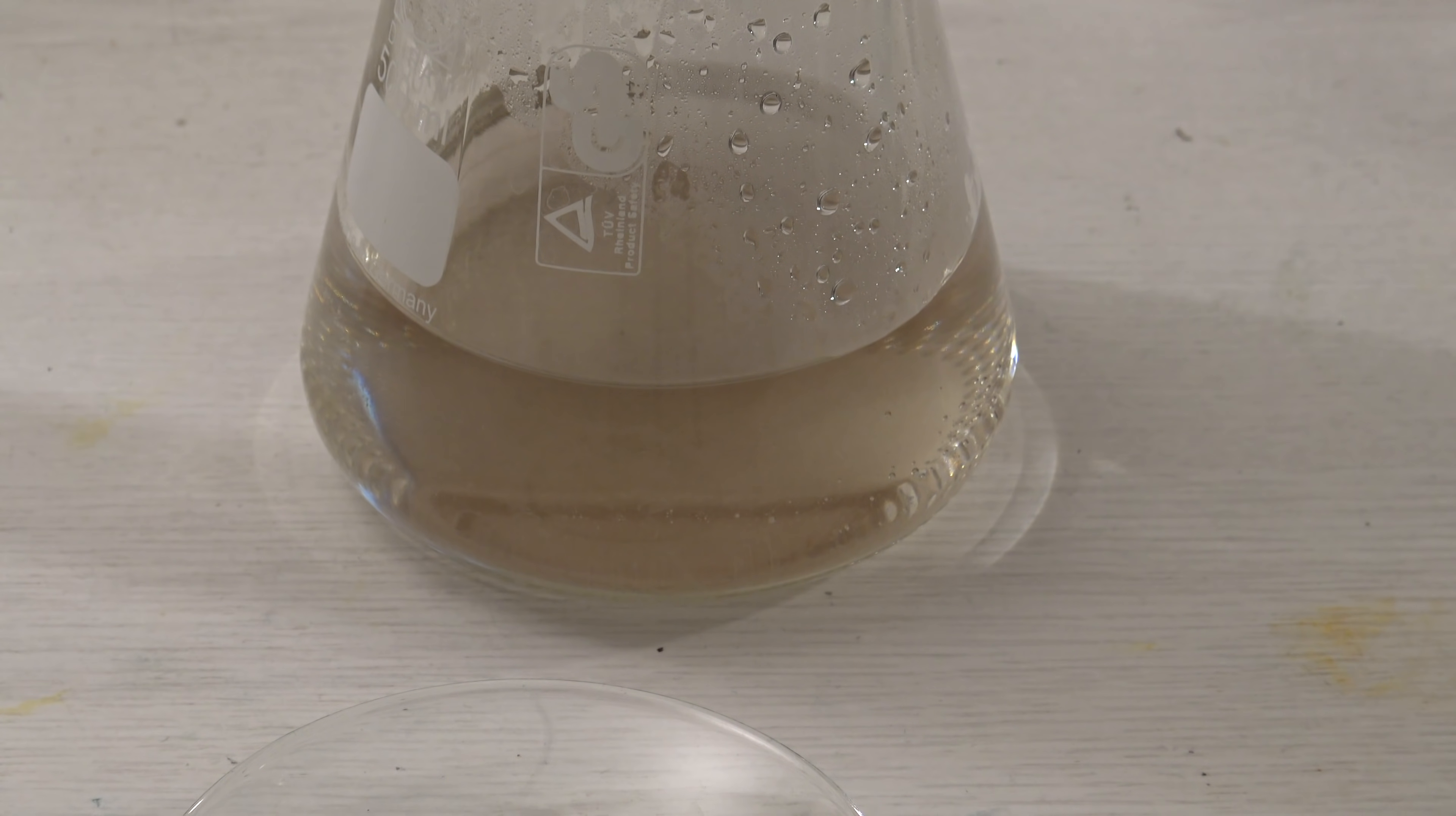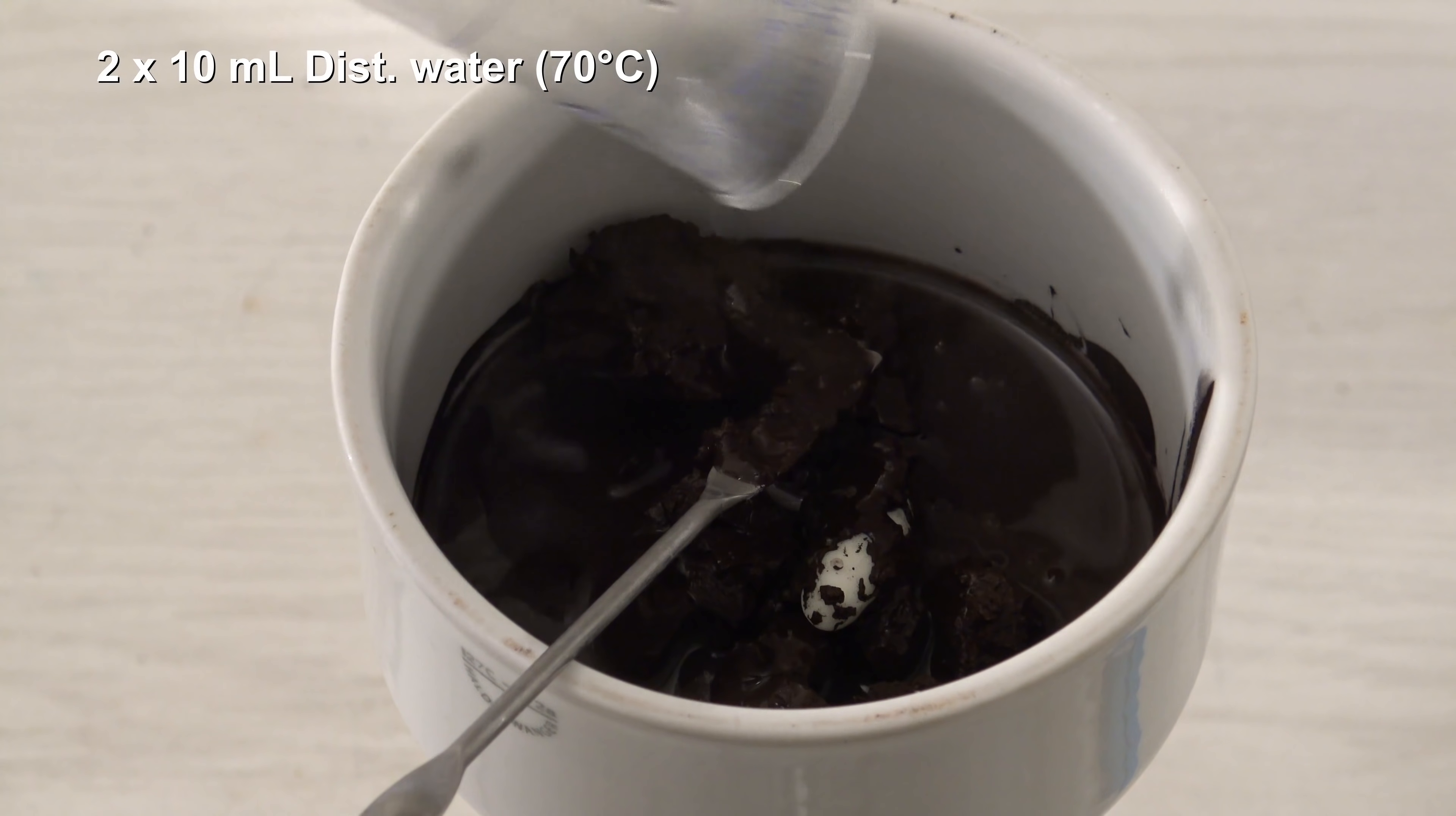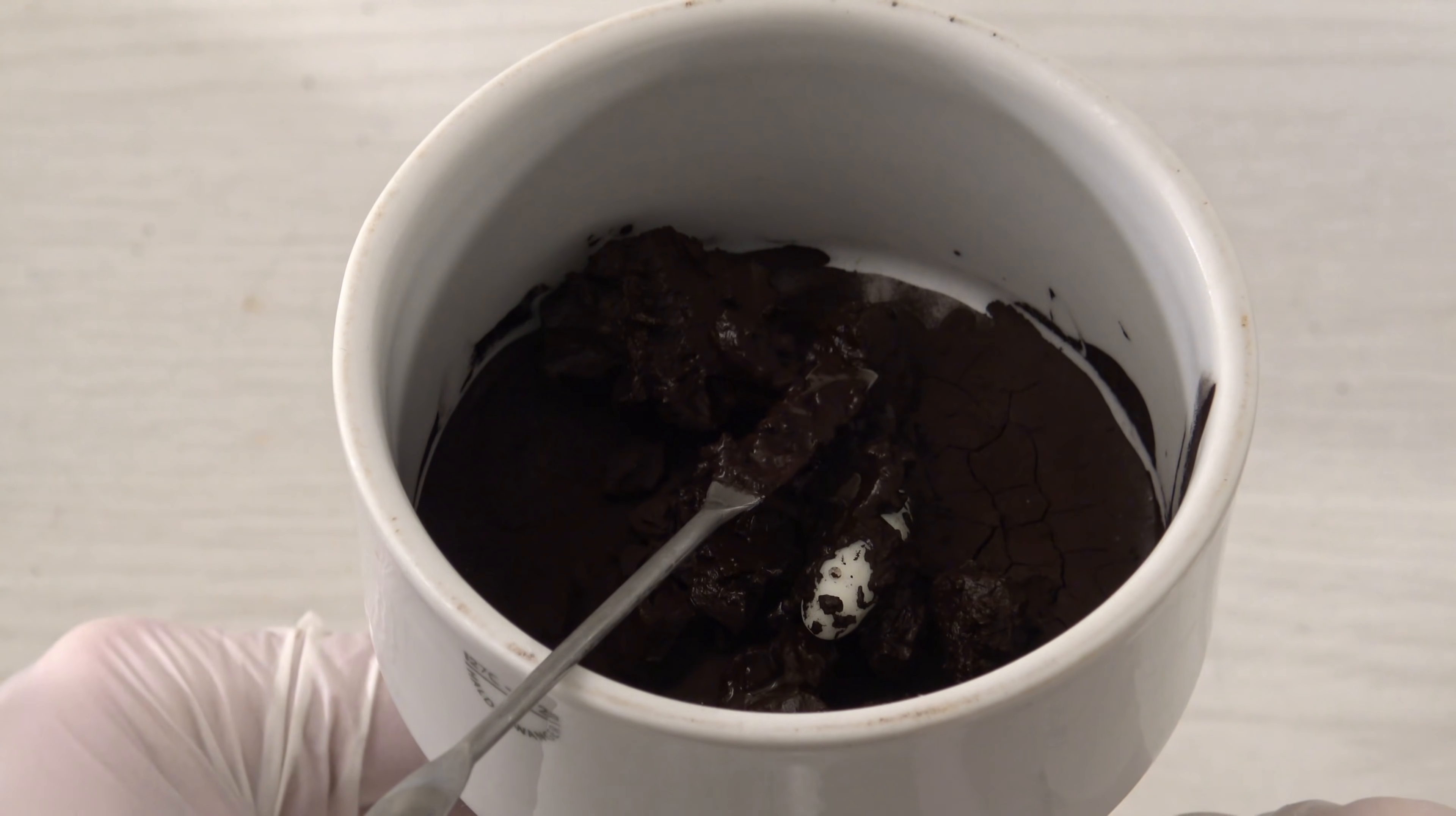Usually, some manganese dioxide passes through the filter, which is why the filtrate had a slightly brownish color. Next, it was washed two times with 10 milliliters of distilled water, which were taken from the 70 milliliters. This should wash out residues of the benzoic acid salt.